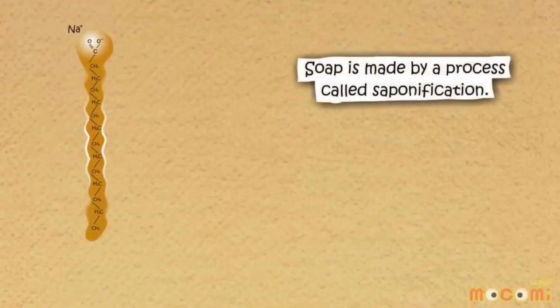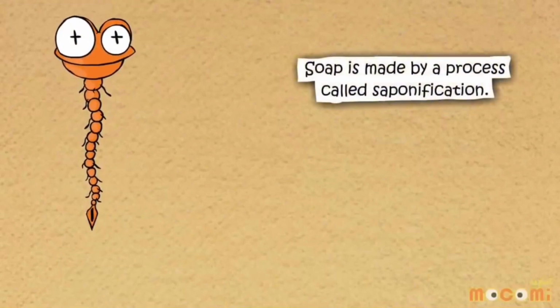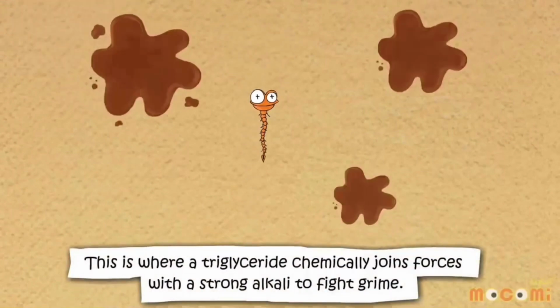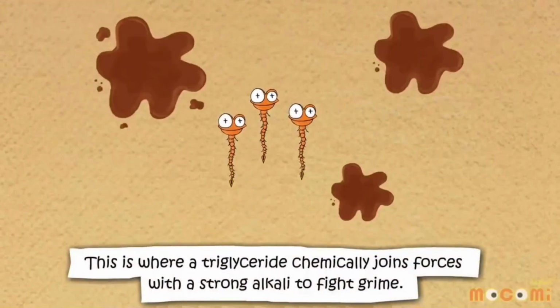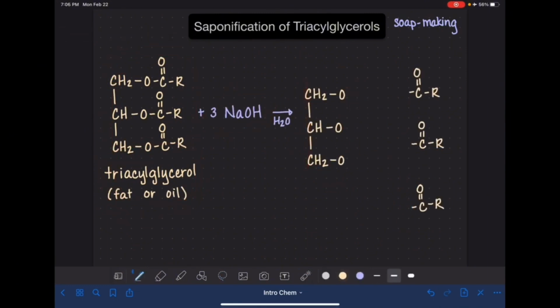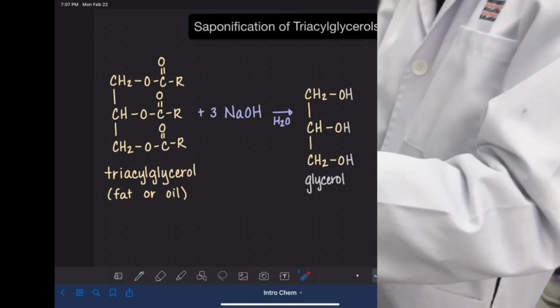Thus, saponification is a process by which triglycerols react with sodium hydroxide to produce glycerol and a fatty acid salt. The chemical reaction between any fat and sodium hydroxide is a saponification reaction. This reaction is shown in this video.